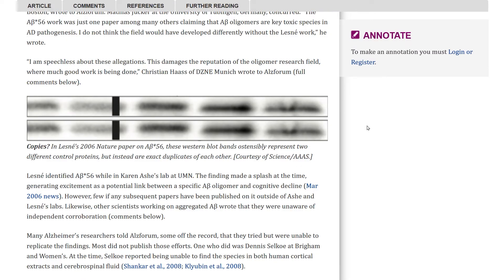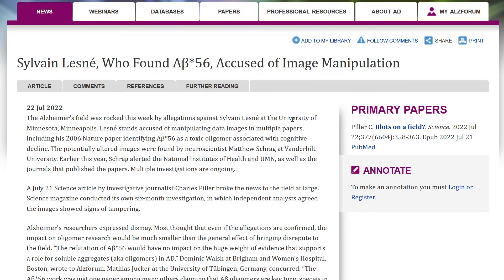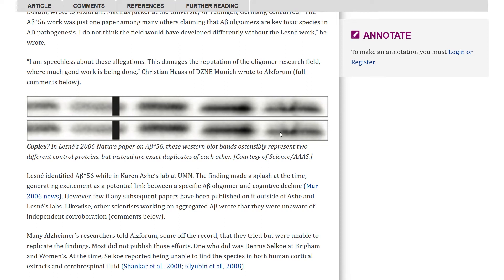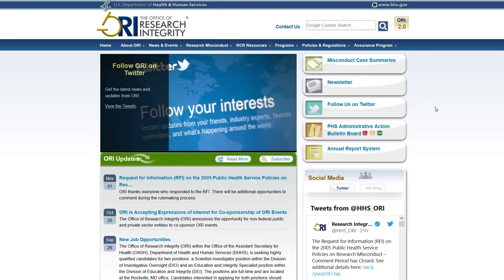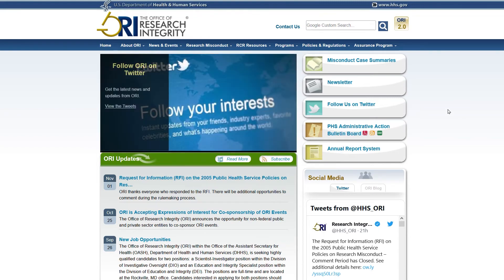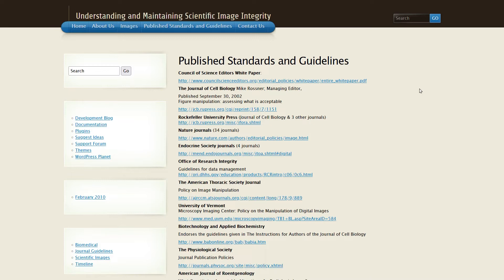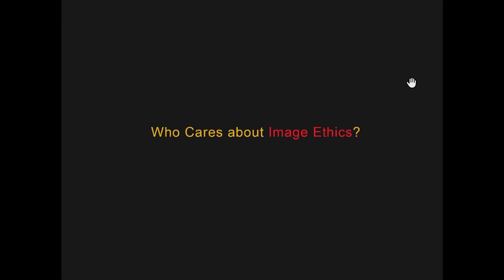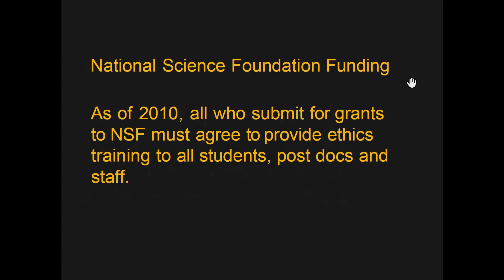This is Dr. Elizabeth Bick. In 2022, she found a paper in which she found image manipulation — these bands had been duplicated when they were supposed to represent two different control proteins, but are exact duplicates of each other. There's also the Office of Research Integrity that oversees scientific misconduct cases, an agency separate from NIH. You can find on the web published standards and guidelines that address what you should and shouldn't do to make a scientific image published in scientific journals. Many people care about image ethics, including the National Science Foundation.